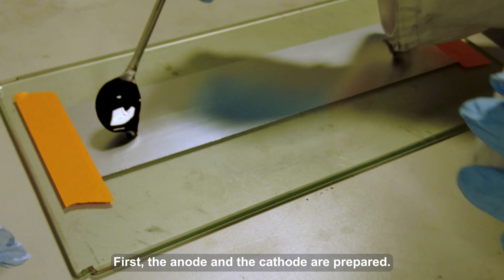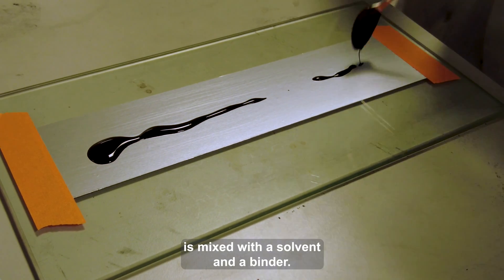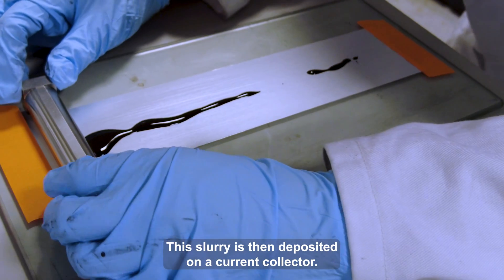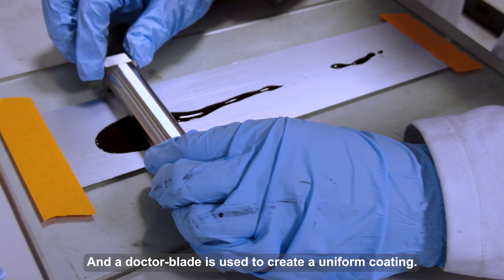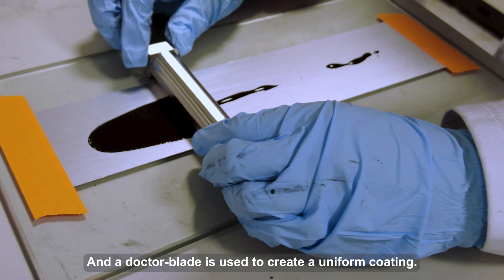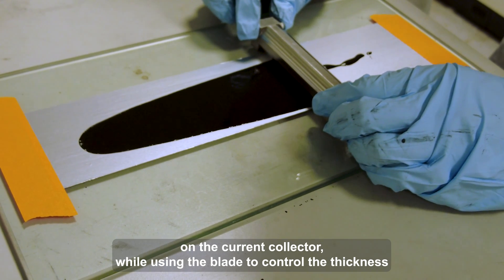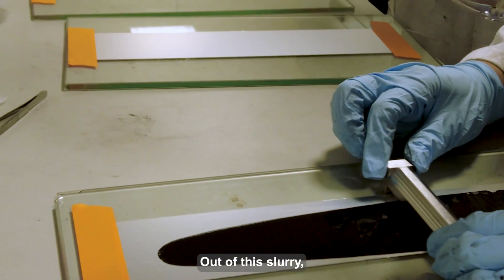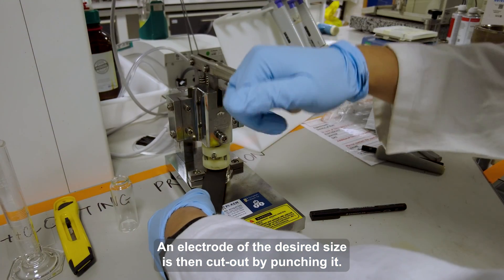First, the anode and cathode are prepared. The active material of interest, which usually comes as a powder, is mixed with a solvent and a binder. This slurry is then deposited on a current collector, and a doctor blade is used to create a uniform coating. This machine will take the slurry and dispense it at a constant rate on the current collector, while using a blade to control the thickness. Out of the slurry, an electrode of the desired size is then cut out by punching it.